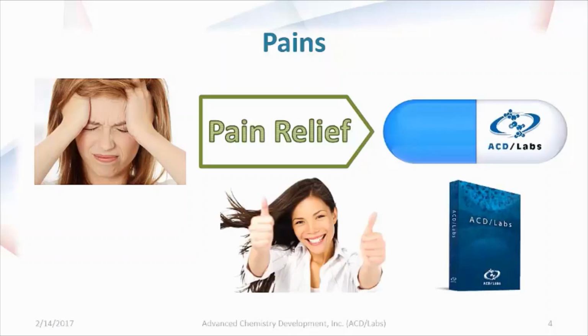And in particular, we're going to focus on a few software packages that ACDLabs offers to help people streamline their method development processes.